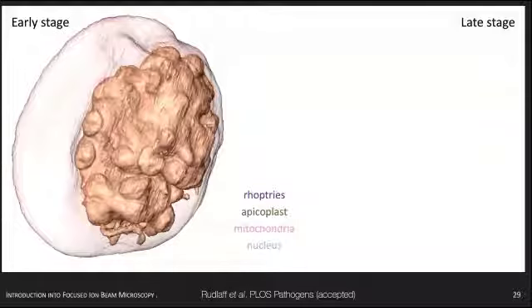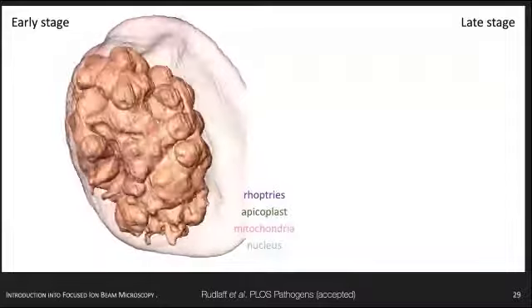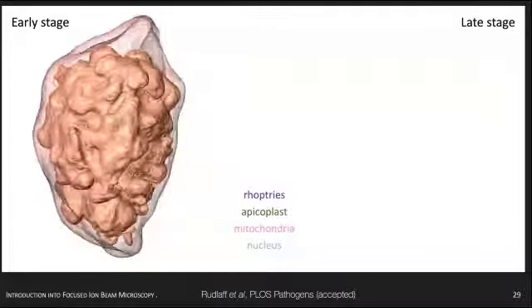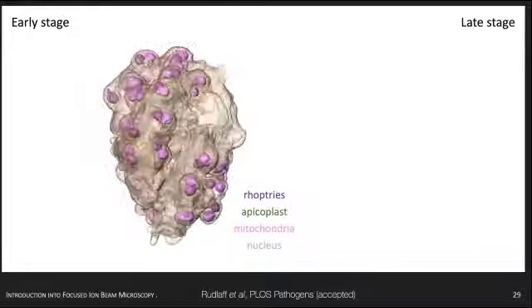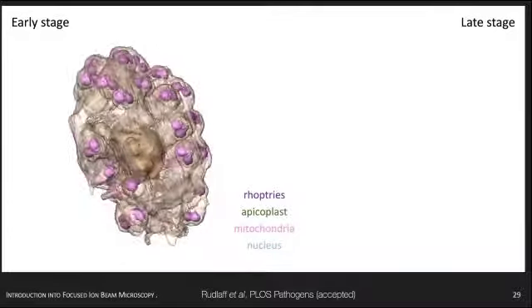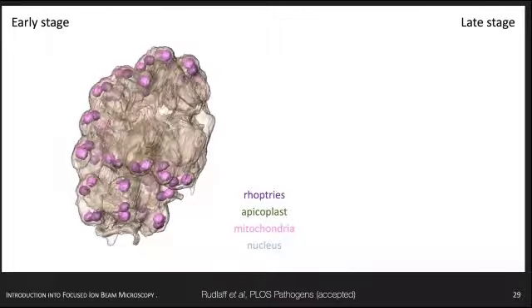The color text corresponds to organelles that are characteristic for that organism. And in the early stage, you can see that the membrane starts to form buds and starts to develop irregularities. You have already a few organelles ready. You see a brown food vacuole.